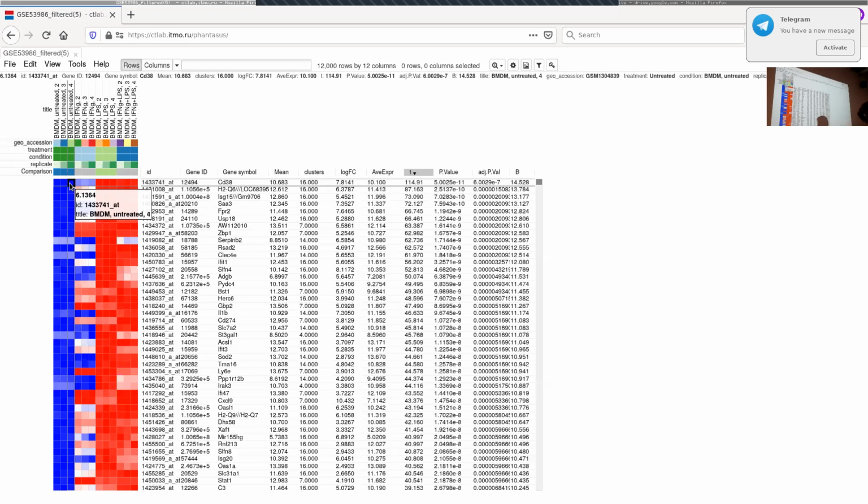So basically, in the p-value, an important part is a statistic value. This is some kind of single value describing some situation, and we have this null hypothesis, which is our hypothesis that nothing happens, which can be different in different cases.